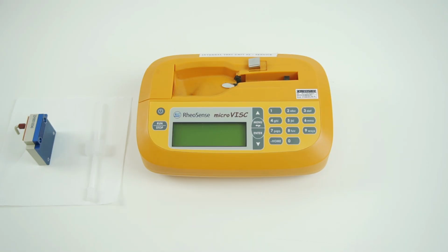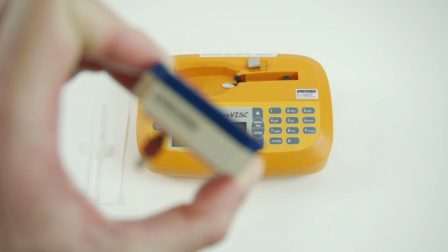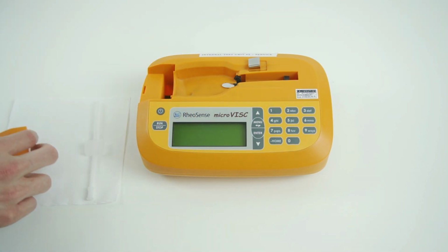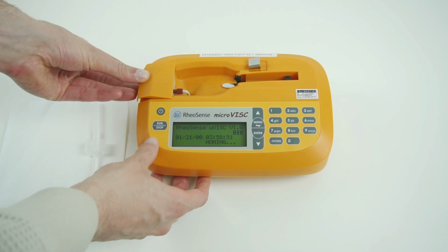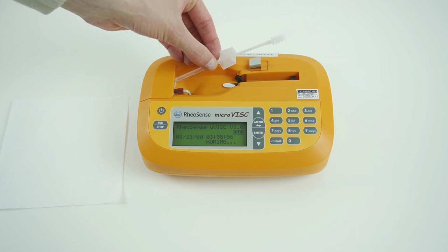The sample that we're going to be measuring today is 0.5% medium molecular weight hyaluronic acid. We're going to be measuring on this microvisc chip, which is a B05. I'll just load that up into the system right now. Turn it on. Load up my sample.